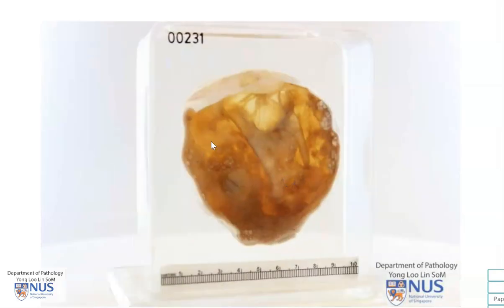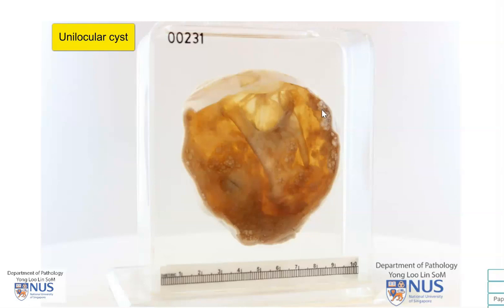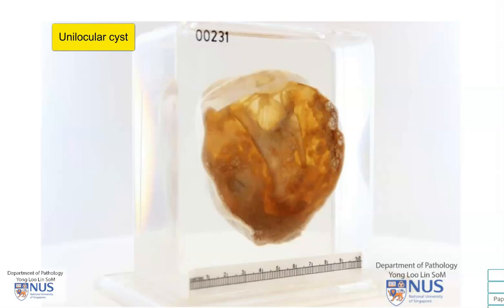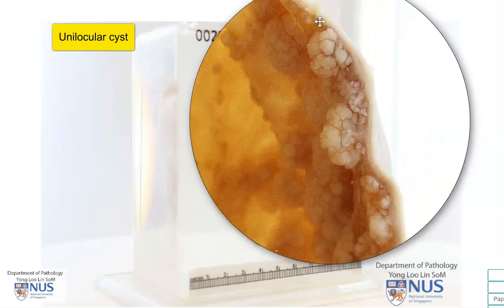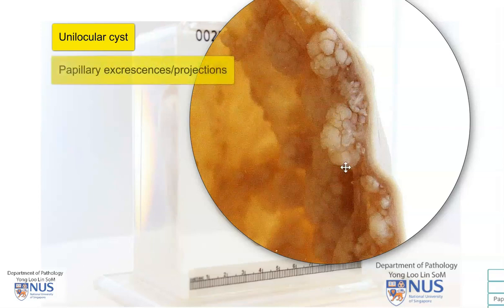Coming back around to look at the inner lining of the cyst, we can observe that this is a unilocular cyst. There is a single large locule, and I'm just going to zoom in on this area so we can see it a little bit better at an angle. Here we can see the cyst wall, which is relatively thin — a few millimeters thick — but there are these cauliflower-like papillary projections or excrescences that are protruding into the lumen of the cyst.